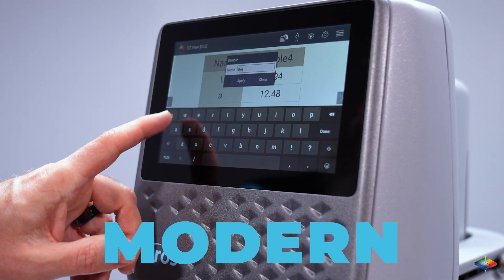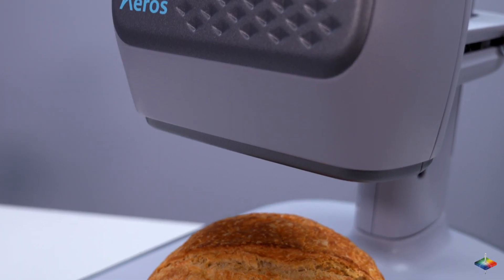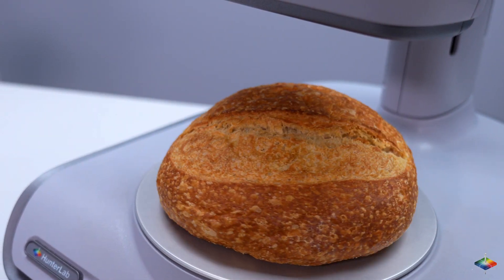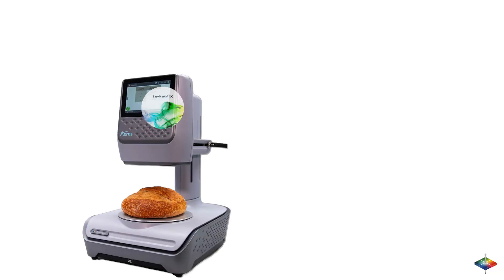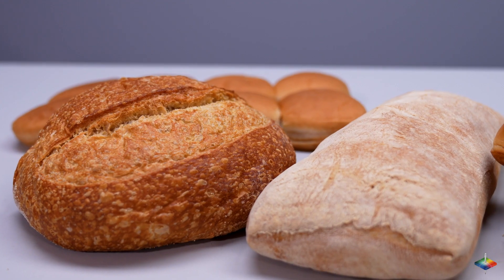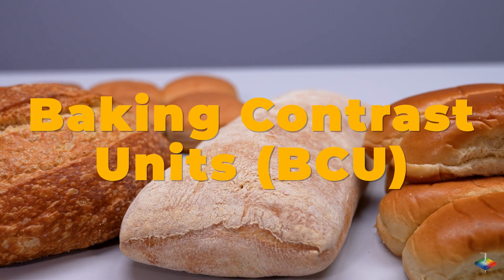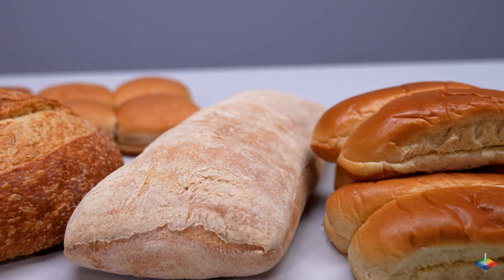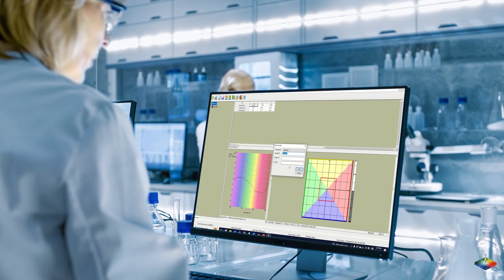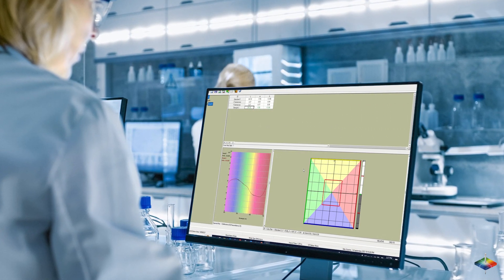With an easy-to-use modern interface and the latest data communication features, our best-in-class spectrophotometers reduce the time and labor necessary to evaluate color. Additionally, they come with color measurement software that can store and recall thousands of standards and all the color scales and indices you need, including CIE LAB and baking contrast units (BCUs). The data is displayed and stored digitally and can be fed into your statistical process control (SPC) systems, facilitating more efficient workflows.